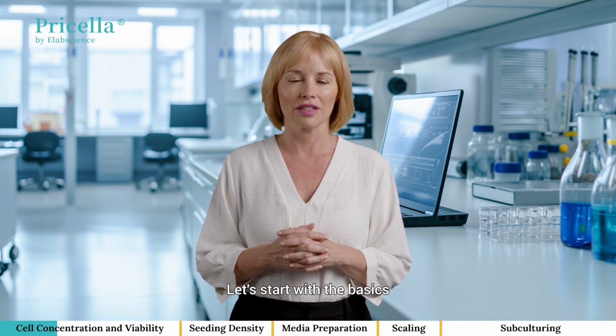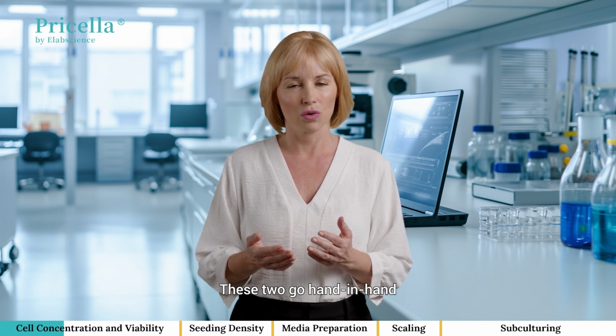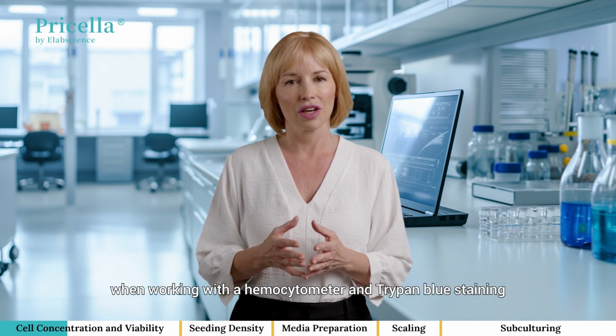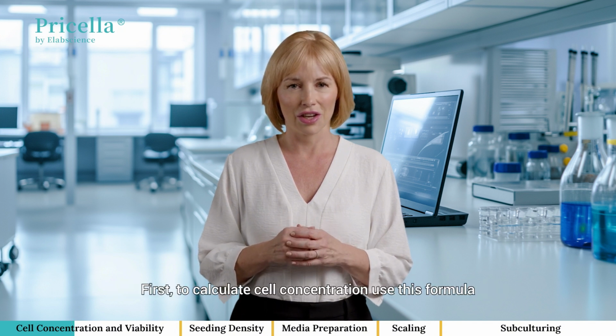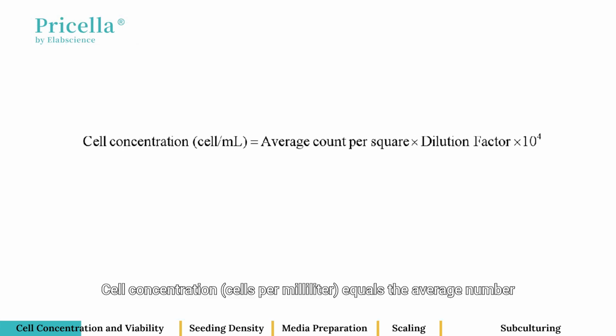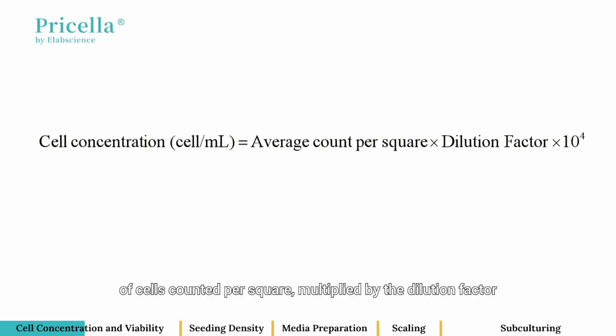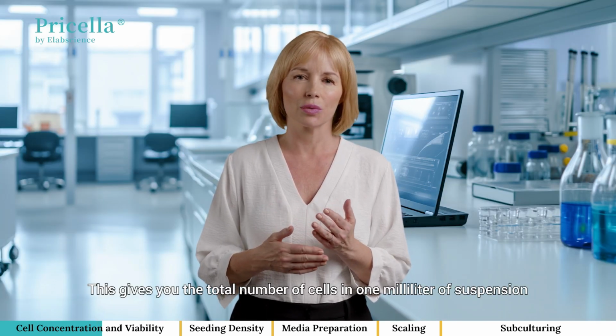Let's start with the basics, calculating cell concentration and viability. These two go hand in hand when working with a hemocytometer and trypan blue staining. First, to calculate cell concentration, use this formula. Cell concentration equals the average number of cells counted per square, multiplied by the dilution factor, multiplied by 10 to the power of 4. This gives you the total number of cells in 1 milliliter of suspension.